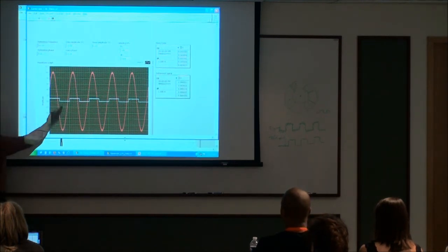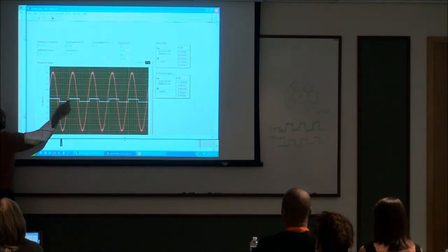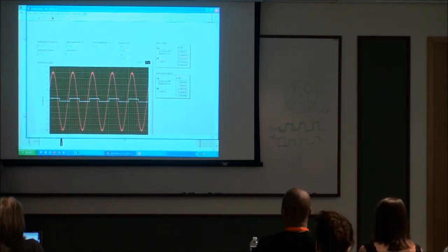The phases of the two are not exactly in phase, but the phase difference is not changing in time. Whereas the red curve, which is the data curve, passes through 0 here, which is the 0 part of the phase, the white curve, which is showing the reference, doesn't turn on until 30 degrees out of phase in comparison. So these two signals are 30 degrees out of phase.